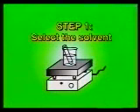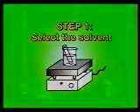If the solid remains at room temperature but dissolves in the hot solvent, then finally this solvent is a suitable recrystallization solvent. The first step is to find a suitable solvent. Remember, the solid is insoluble in cold but soluble in hot solvent.